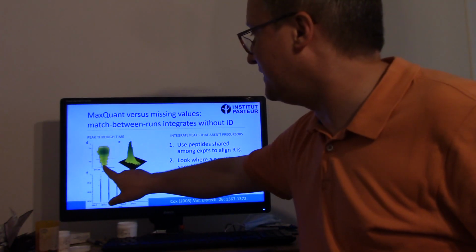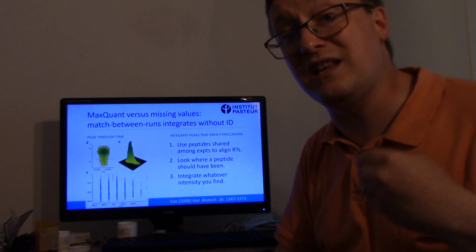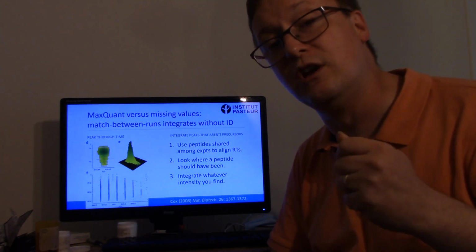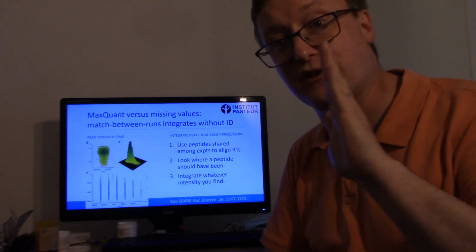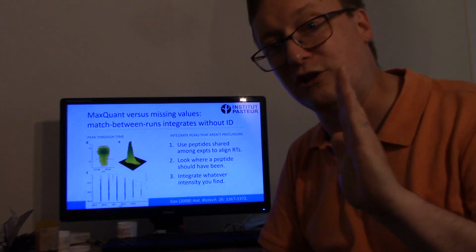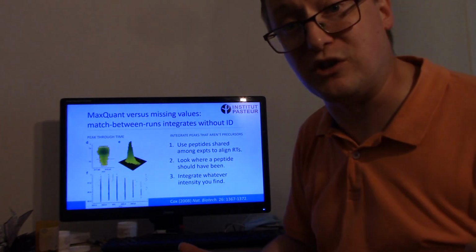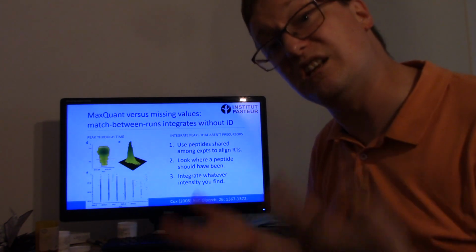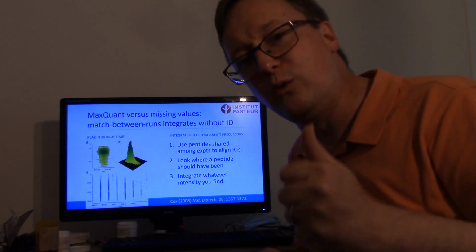Okay, what we see is that there's this jogging back and forth of the center line, which is to say that in successive MS scans, the mass to charge value reported at the center of this peak differs a little bit. It's going to dance a little left and a little right to lower and higher m/z values each time we observe it. So each of these observations is independent.